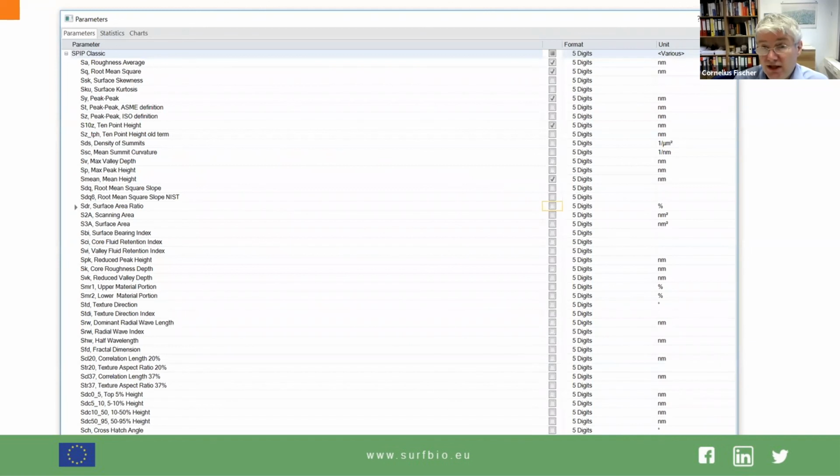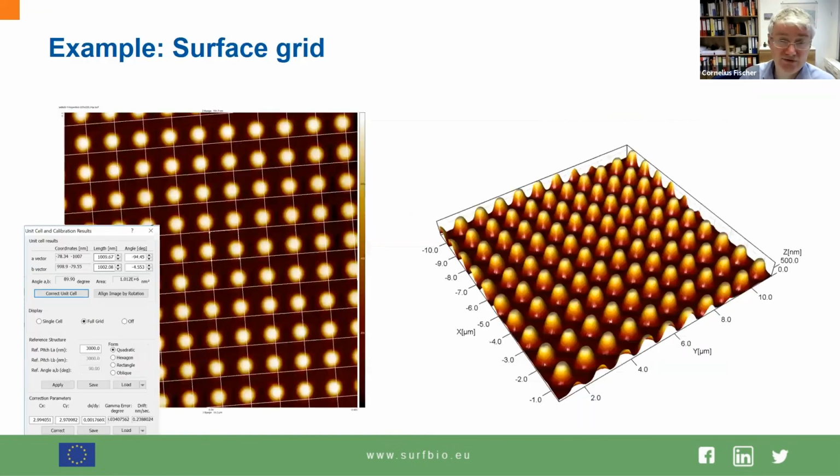It looks like that. If you analyze your data, you can utilize the software that is built into most data collection software packages that are available with these interferometry instruments. And then you can go ahead and analyze things. And in the last few minutes, I would like to show you one very simple example of a regular grid pattern, just to get a better sense of how data sets would look and what analysis can be done and how things are done in a more practical way.